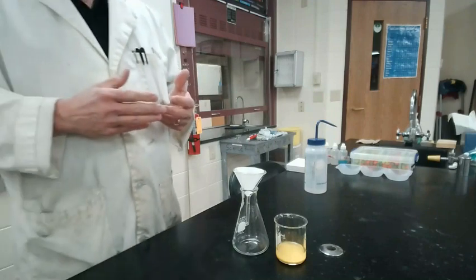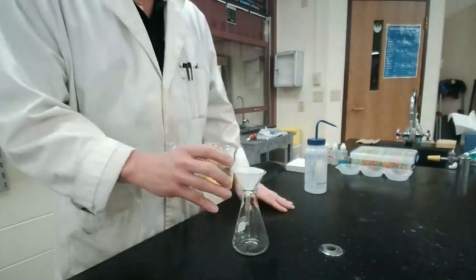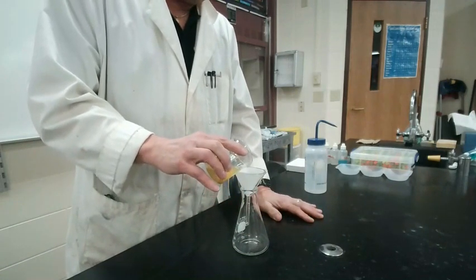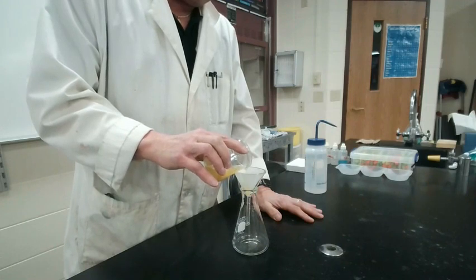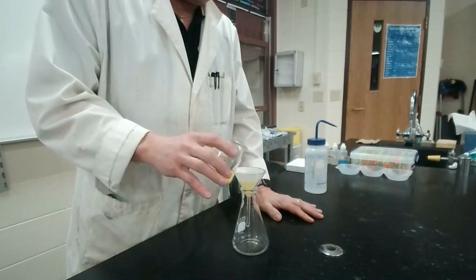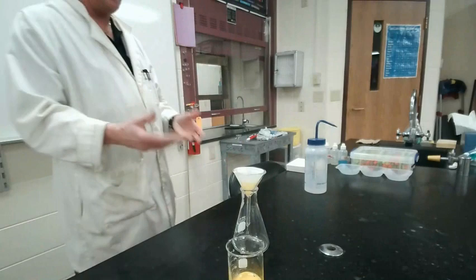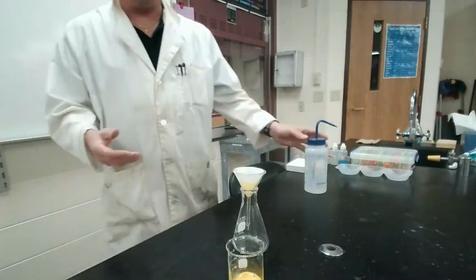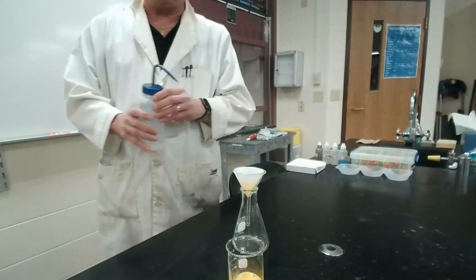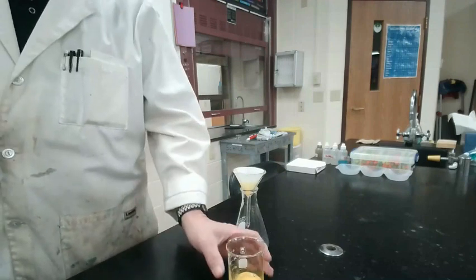So what I'm going to do, ladies and gentlemen, is carefully pour this into the filter paper, but I am only going to try to pour off the liquid on the top. When I start to see some of that solid from the bottom moving toward the top, I'm going to stop. Now, the filter paper should catch the solid so that it doesn't drip down through. But if I overload it with all that solid, it won't drain very quickly. So I'm going to let that keep draining through the filter paper.